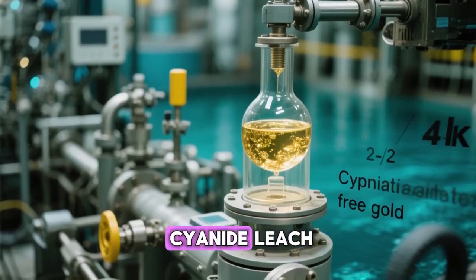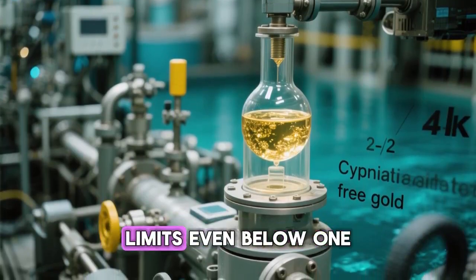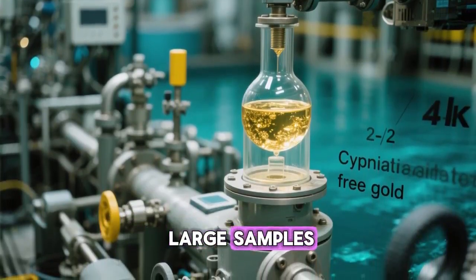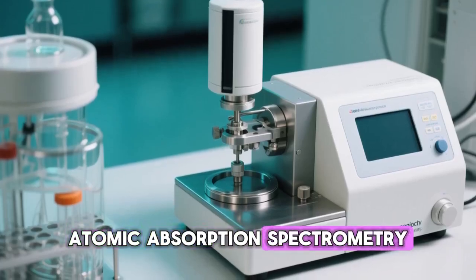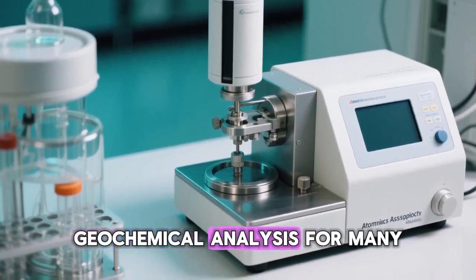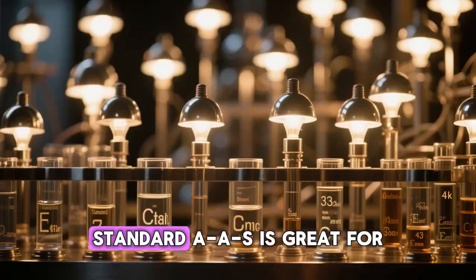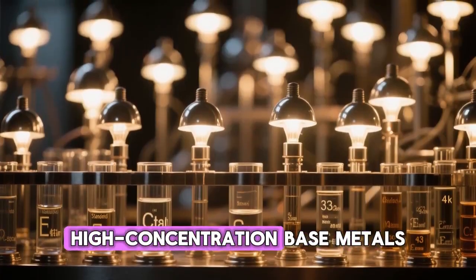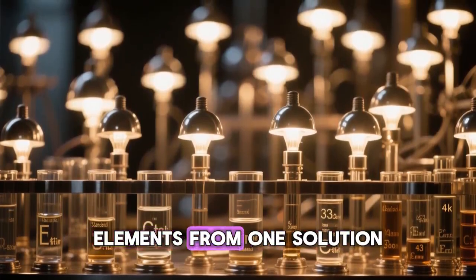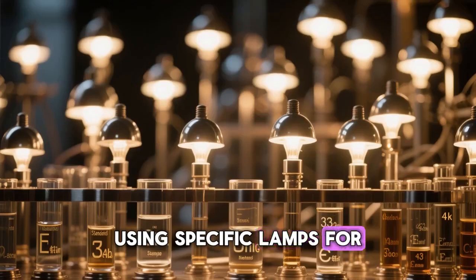Another method is the cyanide leach, which targets free gold and can achieve detection limits even below 1 part per billion by using very large samples. Atomic absorption spectrometry, or AAS, was a cornerstone of geochemical analysis for many years and is still used for specialized applications. Standard AAS is great for high concentration base metals. It can determine about 30 different elements from one solution, one at a time, using specific lamps for each element.